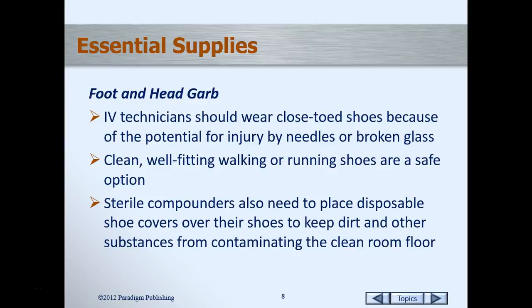So first off, you should be wearing closed-toed, also closed-heeled shoes. We don't want to risk any injury from broken needles or broken glass, or dropping a syringe. You could spike your foot if you're not wearing the right kind of shoe. So either leather or some kind of grade polymer component.